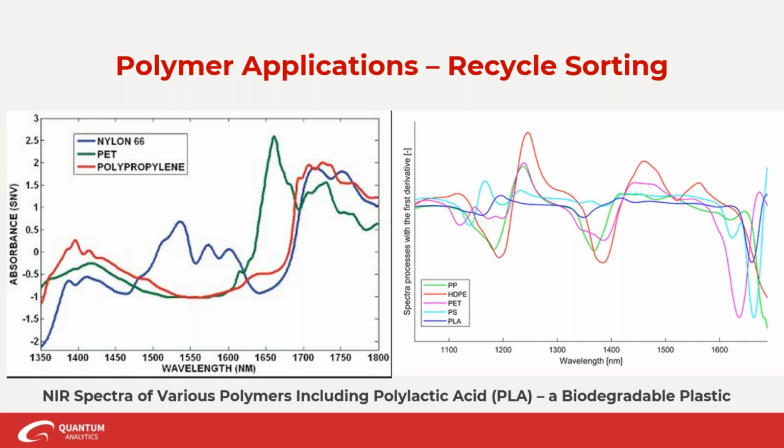So they sent me samples of the 5 catalysts. I scanned them, did some of this data pre-processing, and there was enough distinction in the near-infrared spectra to be able to use that to identify what the catalyst was. And it was a beautiful setup. They actually had a flow cell, and it would scan and identify, and if it matched what it was supposed to be, the valve would open and let the stuff in. And if it wasn't, then they could stop it before any kind of damage is done.